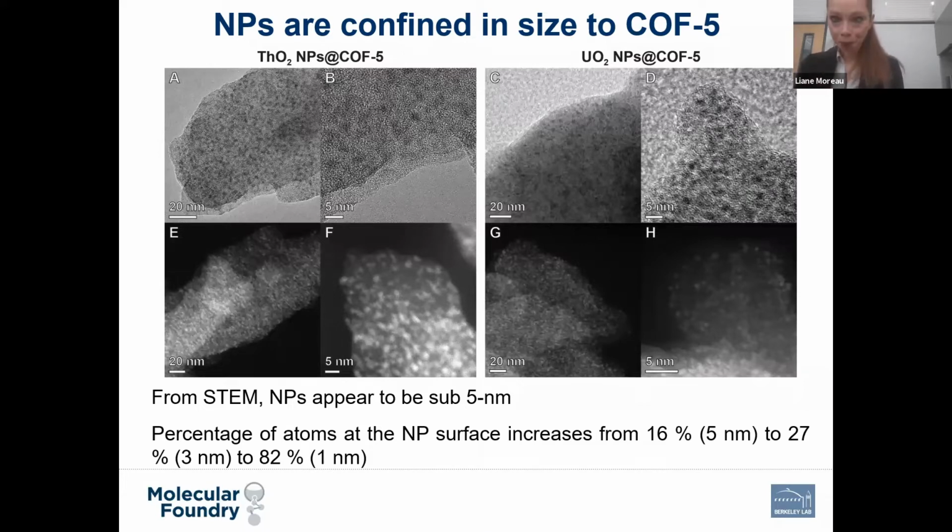contrasted color. We can also see though that it's not really great to get microscope images in a system like this, because since the framework it's a two-dimensional framework, but it's stacked in 3 dimensions. And then those particles are on the micron scale. Well, to get good microscopy images, you really need things to be kind of 100 nanometers or less, because otherwise you can't focus any individual particle based on getting in the focal point.